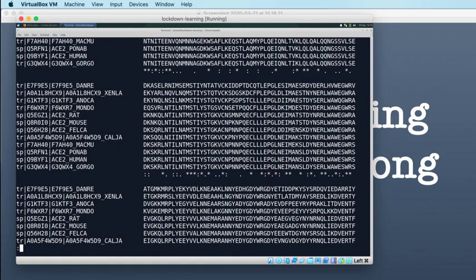That's a relatively instructive thing to have done, and I am not going to claim that I did that on purpose, although it is quite useful sometimes to make these mistakes on purpose. That isn't what I did here. Believe me, this was a genuine and honest mistake. But hey, we found it, and that's a positive thing to take forward from today.